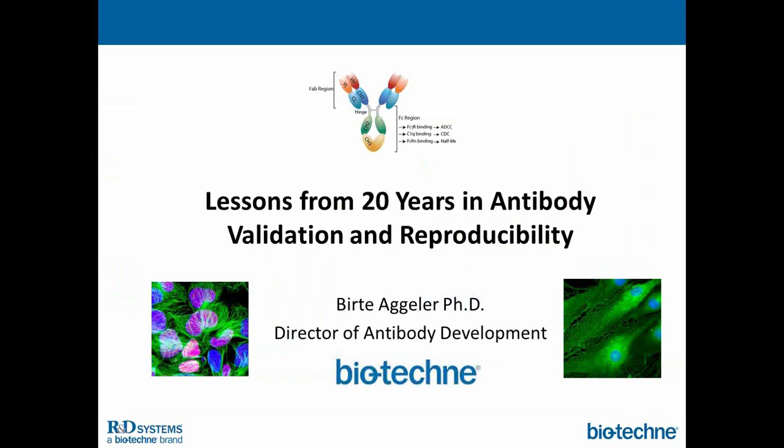From Nicholas Bartholomew. His question is, do you see any differences in the antibodies that you choose for those used for ICC applications and IHC applications? Yes, we do. In some instances, and we've seen this very repeatedly, sometimes you will not be able to find a clone that will work in both ICC and IHC.